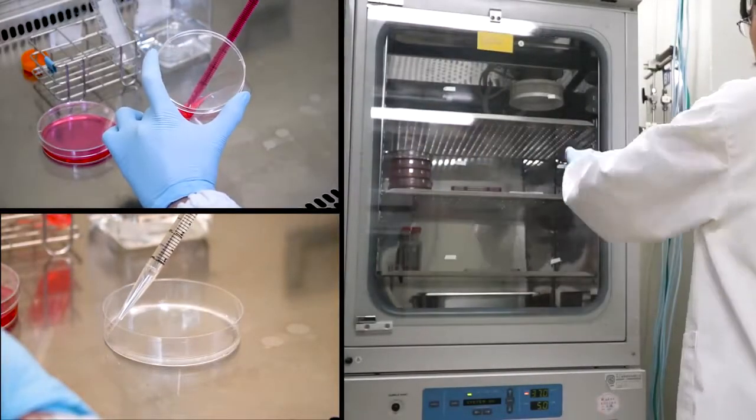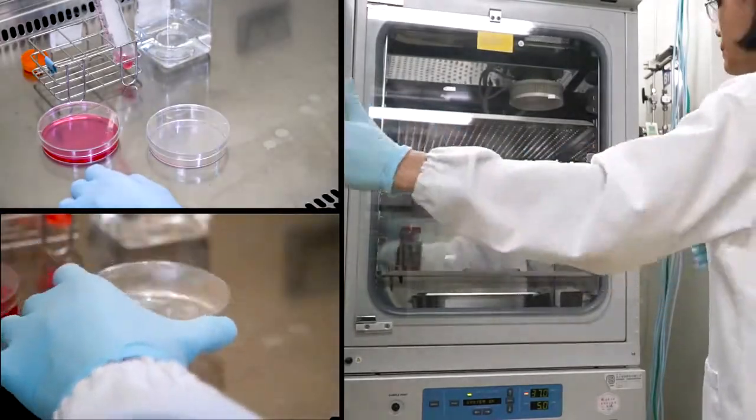In addition, EITRI has made breakthroughs in the low recovery rate bottleneck that is seen in most 3D cell culture technology.